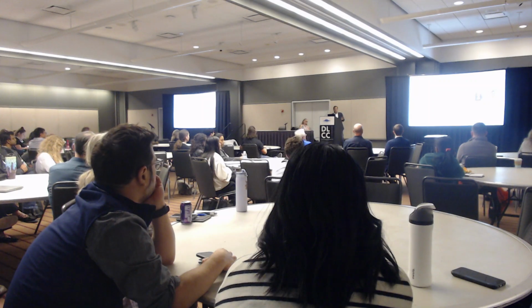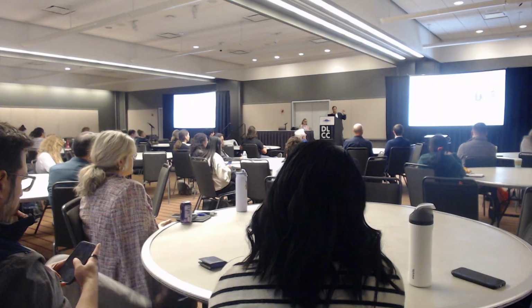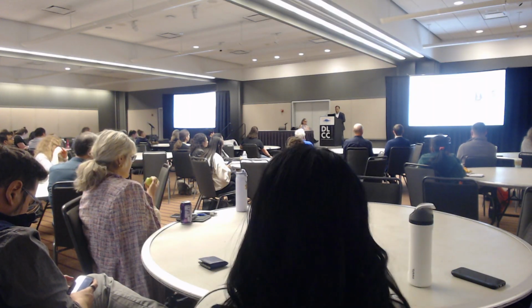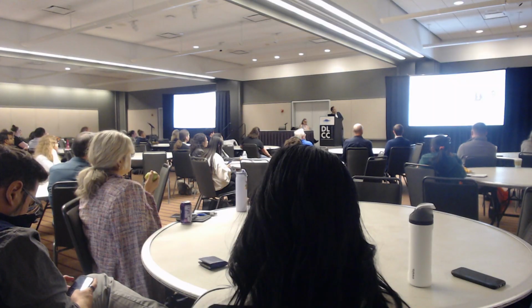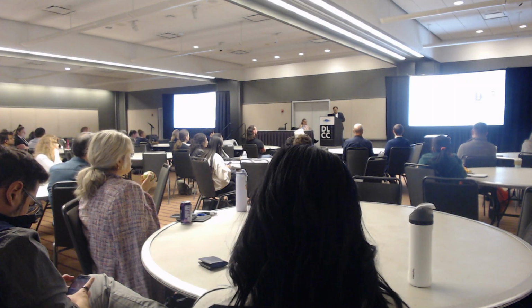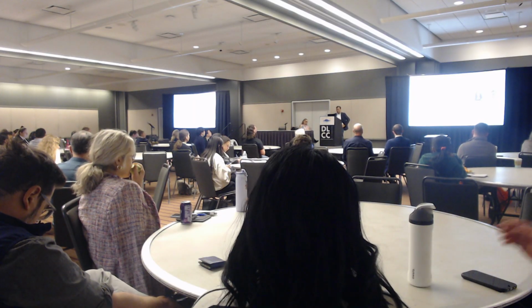So the core is divided into two sections. I lead the chromatin analysis part, where we provide all these different expertise and assays to resolve histone modifications, DNA-protein interactions, chromatin accessibility, and 3D genome profiling, which will be a major part of my conversation today, on how we optimized our assay. I'm supported by these two talented technicians. The staff in the lab, we are small, but not small in the output. And we recently onboarded a bioinformatics support faculty. She leads a bioinformatics group and a lot of the analysis pipelines that we deal with for all these omics assays.